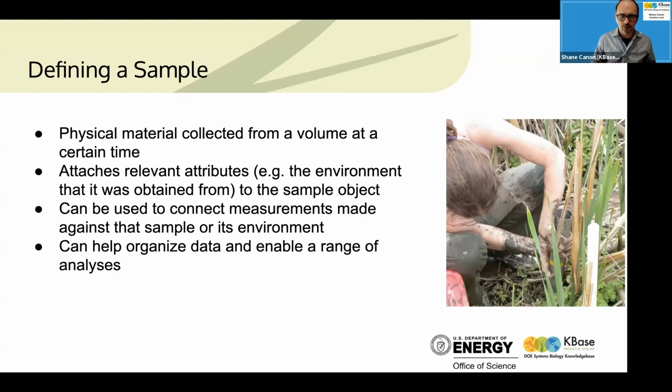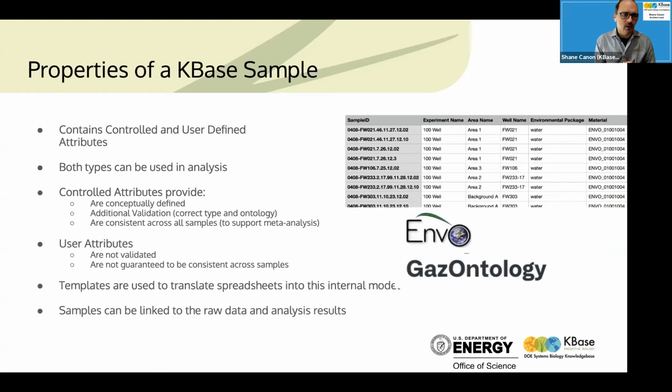And then we can also use this to link measurements to, and so this allows you to use it both in your analysis, but also it allows you to eventually bring together data from different modalities and be able to do more sophisticated analysis with that data. And then finally, it helps you organize all of your data as well. Okay, so next slide.